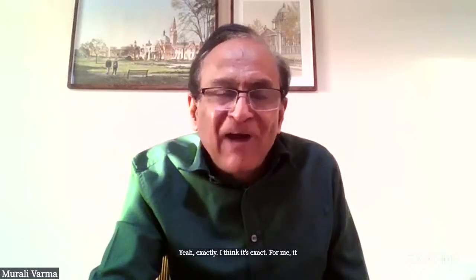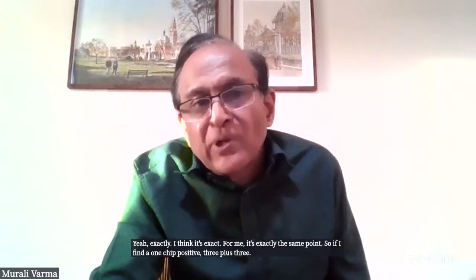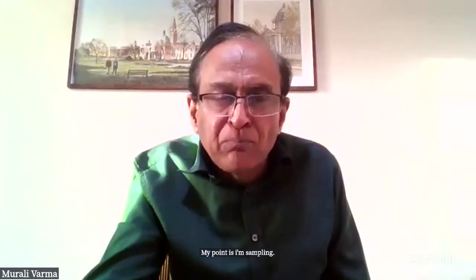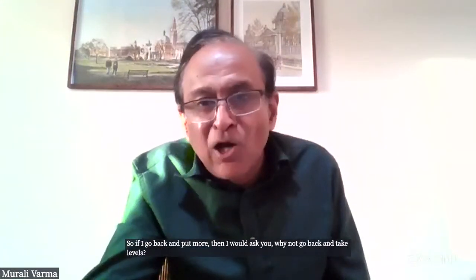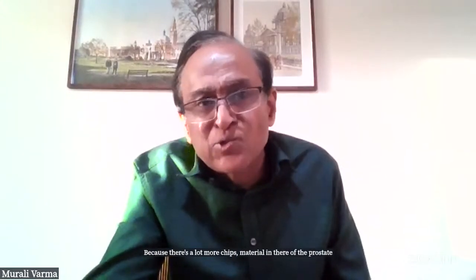Exactly. For me, it's exactly the same point. So if I find one chip positive 3 + 3, I don't go back and put any more. My point is I'm sampling. If I go back and put more, then I would ask you, why not go back and take levels? Because there's a lot more chip material in there of the prostate that you haven't examined. And where do you stop?